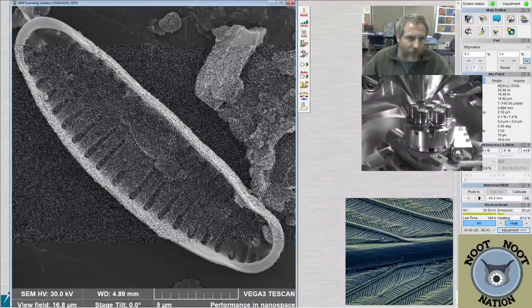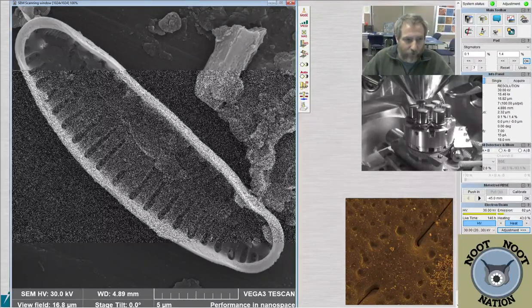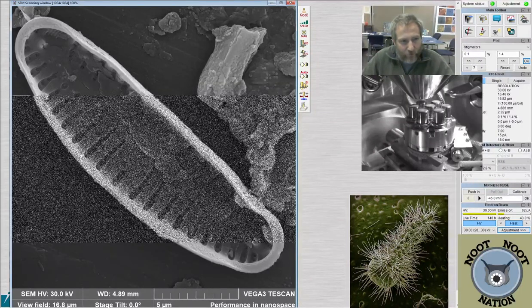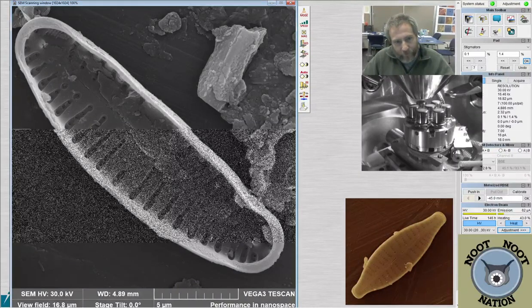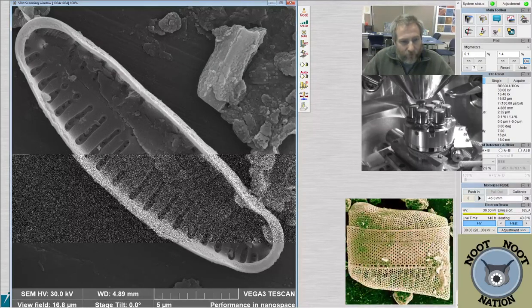So up here you can see there's sort of a weird structure, like it's like gills or something. It's actually the apical pore field. And then this is the helictoglossa, which is the internal expression of the raphe end. There's another one down here, the end of the raphe. And there's some clay over top of the actual raphe itself, which is this line that runs through the middle of the sternum, and it's eccentric, which means that the raphe is closer to one side of the valve margin than the other. Because it's a little bit more dome-shaped on this side and a little flatter on the belly side, this is the dorsal and this is the ventral, and the raphe is slightly eccentric towards the ventral side in this case, and then all of those characteristics basically put us into Reimeria.